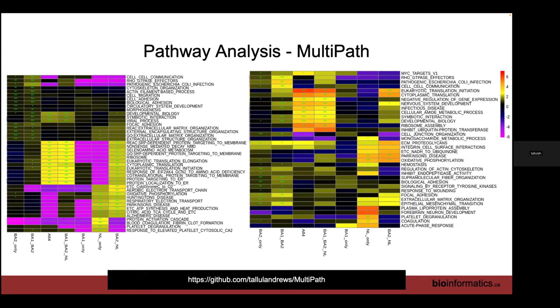Okay. So it means if you're looking at the top 10 pathways in each cell type, now at least those are 10 different pathways instead of 10 pathways that are all the same. But otherwise, yeah, you just do it the same way as any other data set.